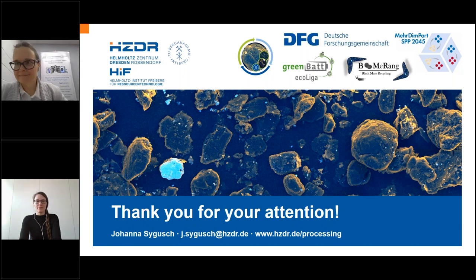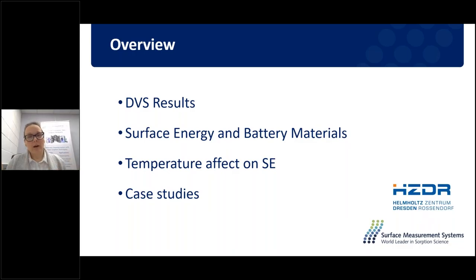So I will just continue with the characterization of these materials that Johanna introduced, and I will not show them again. First I will show you some DVS results, and then some surface energy data and why the surface energy is important. And at the end, I will show you an interesting case study on the interfacial interactions in solid-state batteries.